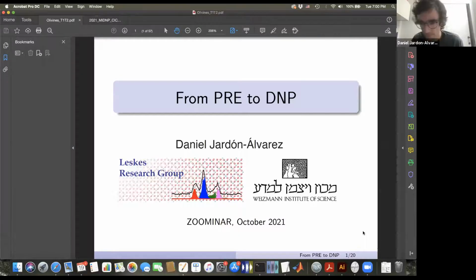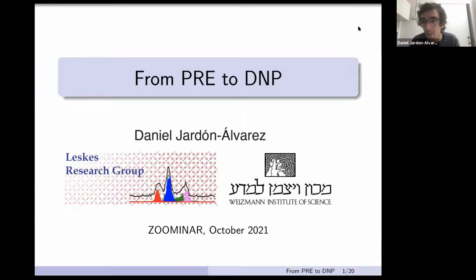Okay, so Daniel. Thank you very much for the introduction and for the opportunity to show some of our work here. What I want to talk about today is what we can learn about DNP if we understand the paramagnetic relaxation enhancement from the polarizing agent that we introduce into the sample.